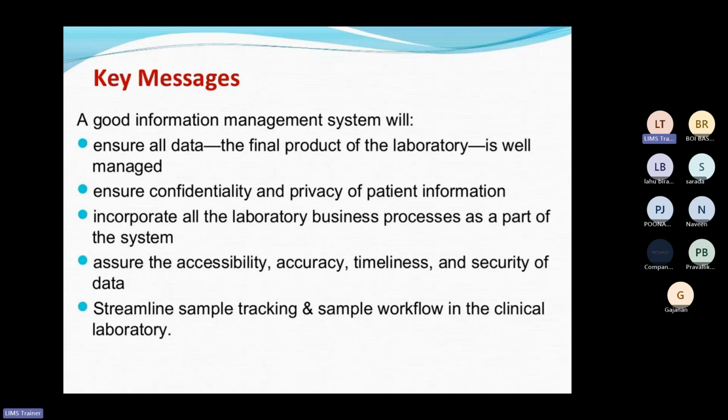Then the sample tracking and sample workflow. Not only in clinical but in all types of laboratories, sample tracking is important. Sample tracking means at what stage that particular sample is, starting from sample registration to report generation. At what stage that particular sample is, all this data will be readily available with the software.